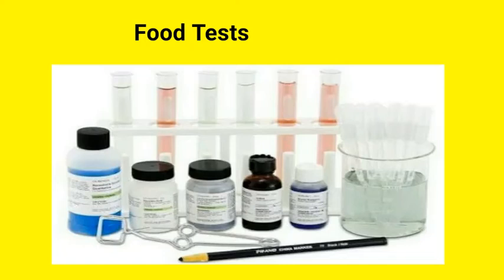Food tests. Food tests are performed to detect the presence of different components of foods like carbohydrates, fats, protein, starch, etc.